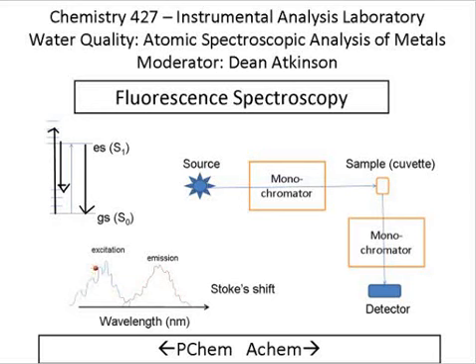So there are a variety of different transitions that are involved in taking the molecule from the ground state to the excited state. This is basically the absorption spectrum of the molecule. If you wanted to record that as an absorption spectrum, of course you could record it in absorption, but you can also just fix the emission wavelength and scan the excitation wavelength, and you would get a spectrum of this nature.